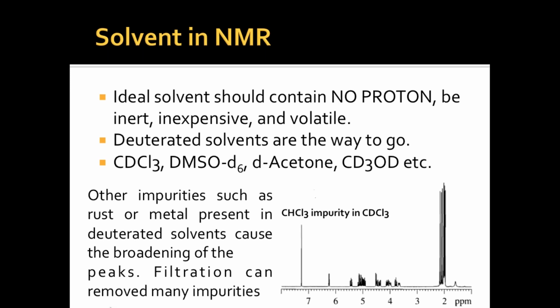Now, how does it work in the NMR? Of course, all of these, CDCl3, DMSO, acetone, CD3OD, now have deuterium, but all those solvents have some impurities.